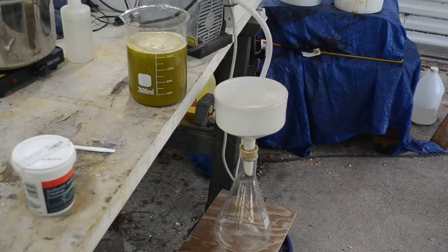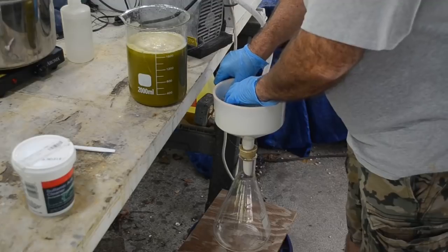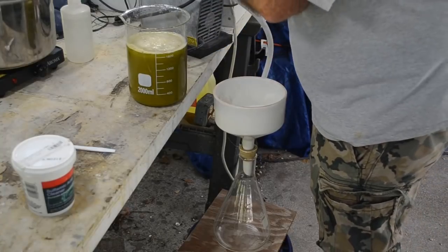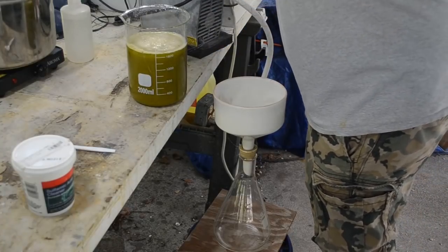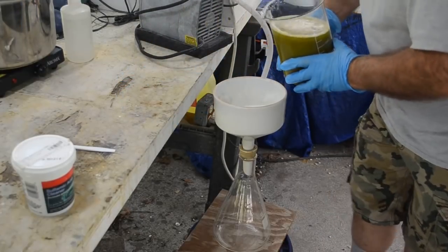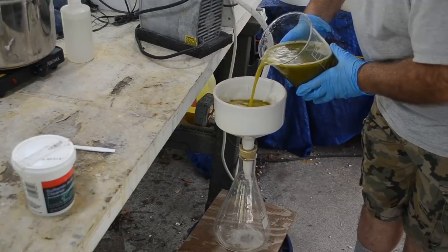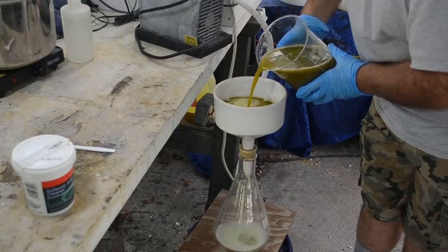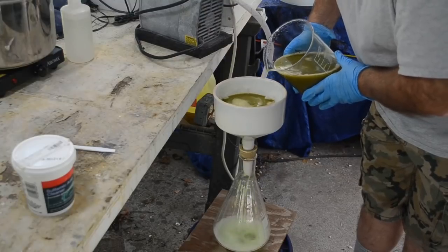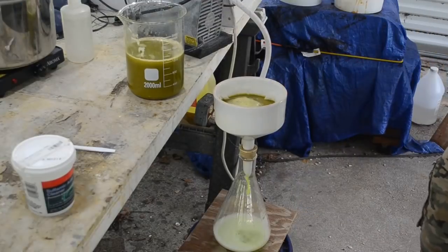Okay, the ice has finally melted, so it's time to filter this stuff one last time. Now, this may take a little while because there's a lot of paper pulp in here and whatever that weird white precipitate was. So I expect the filter will clog up and this will go fairly slow. So yeah, it's going pretty slow.